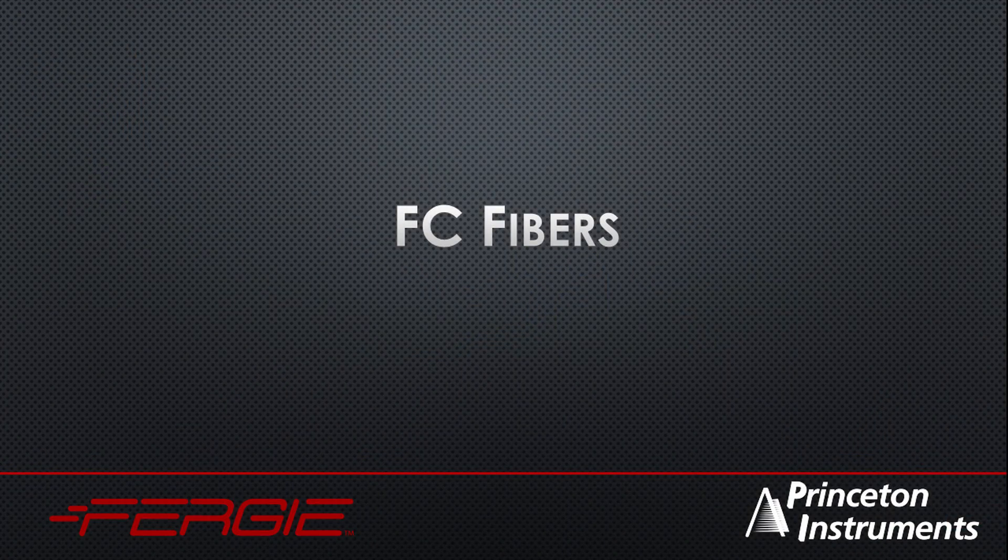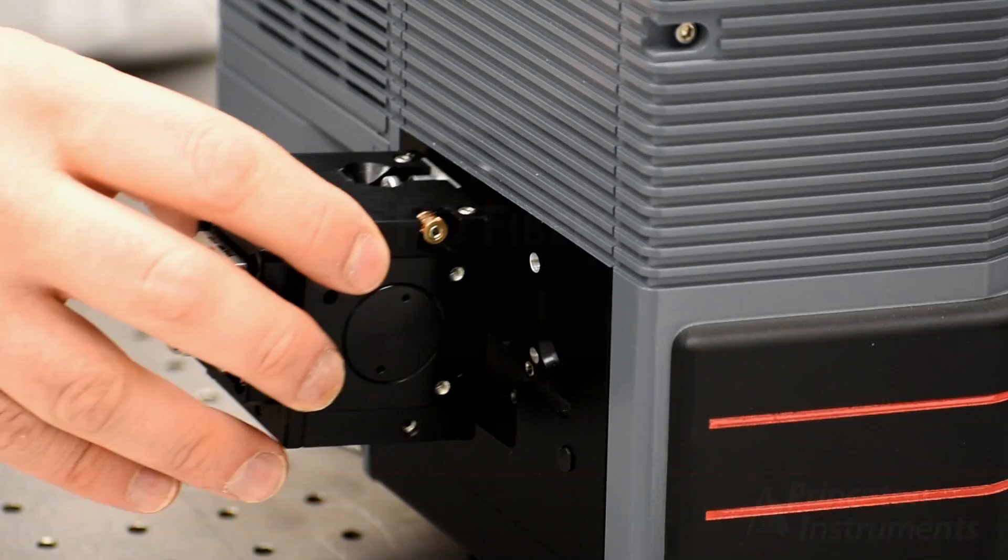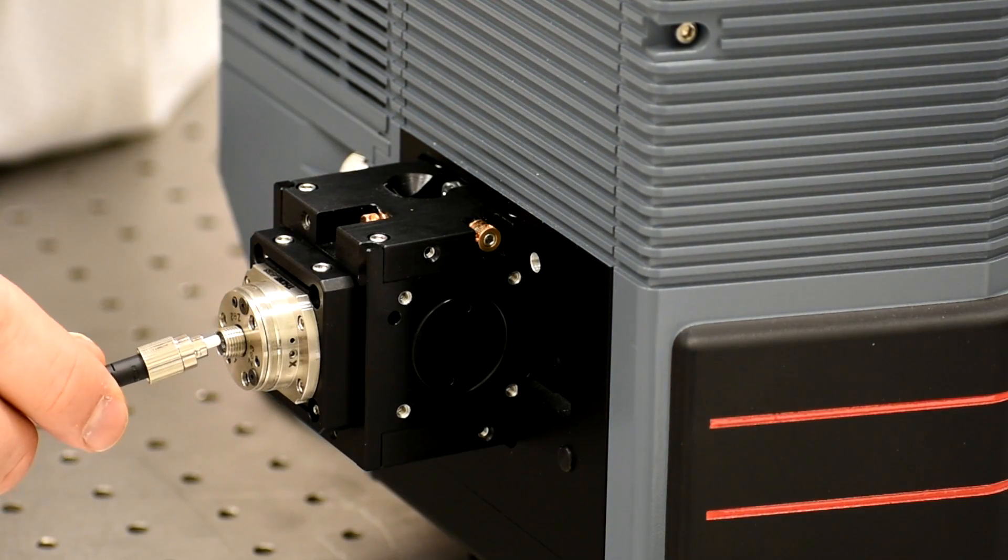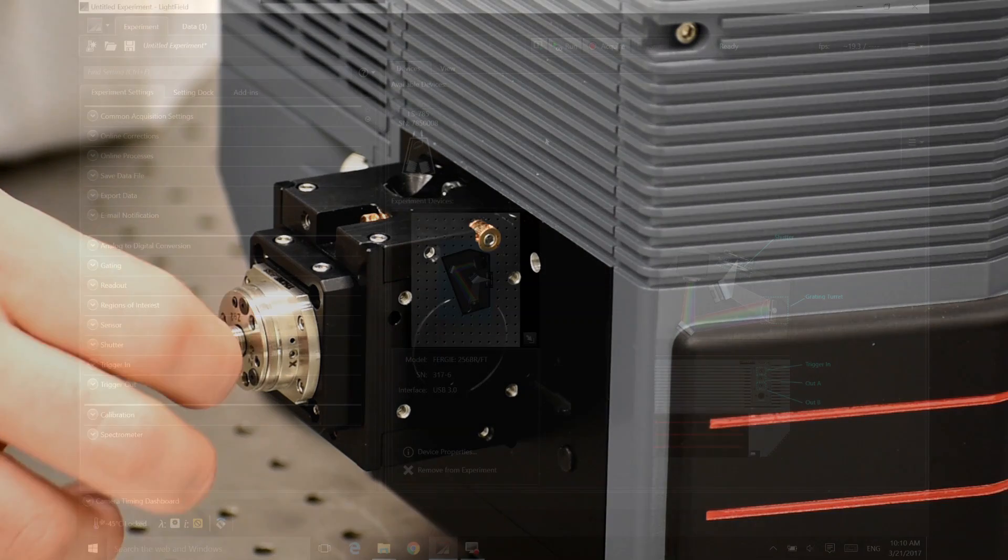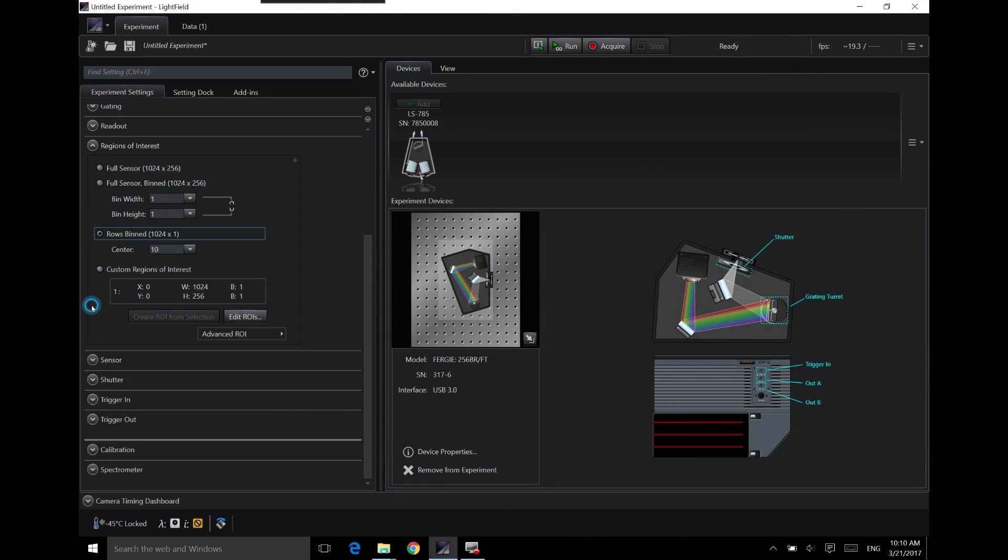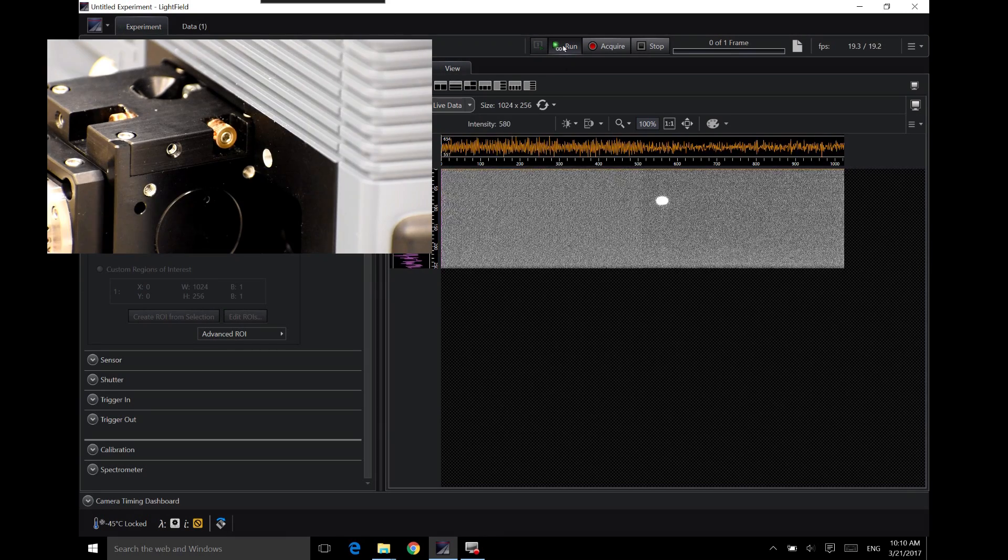Here is how to connect FC fibers. Simply attach the focus cube assembly and insert the fiber optic cable. Now open the Light Field software and select full sensor in the region of interest settings. Then press run to observe a live image of the fiber on the CCD.